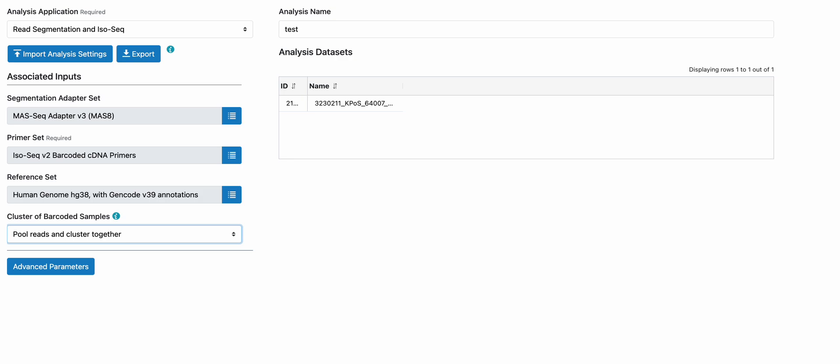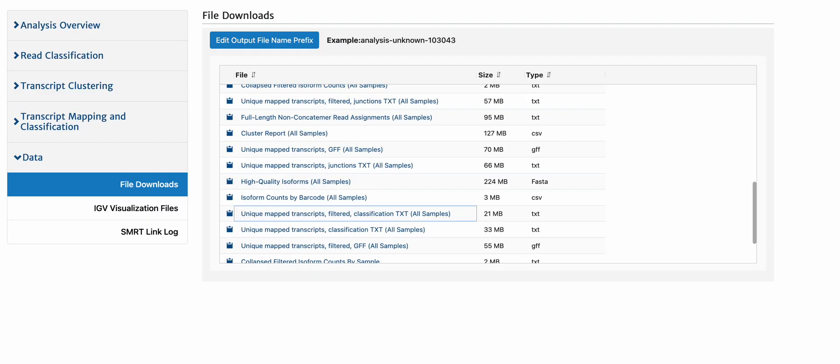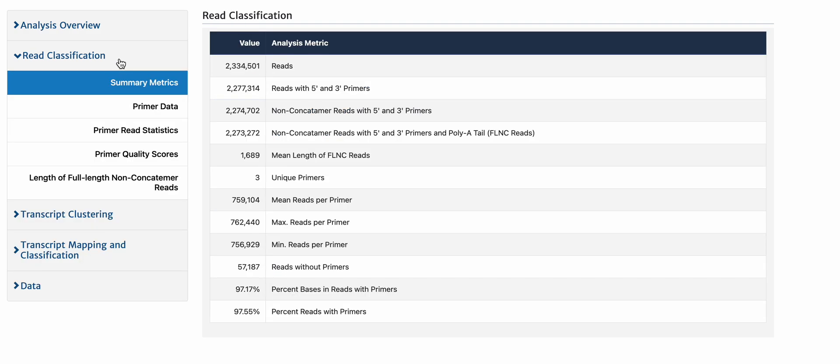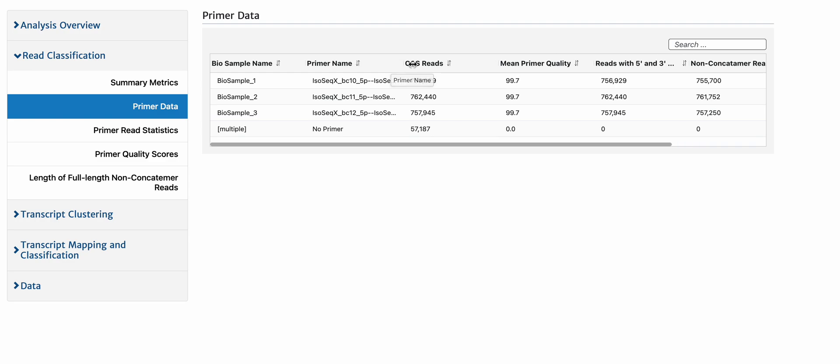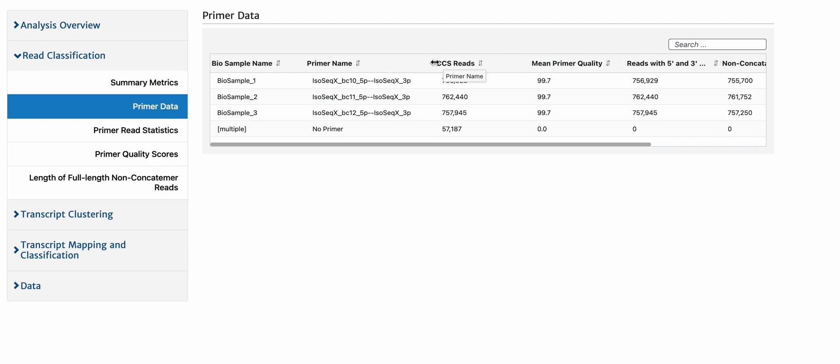Let's take a look. I've chosen two toy examples and I've run them once with pull reads and cluster together and once with separately. This is the pull reads result. You can see that I had subsampled three different barcodes, each of about 700,000 reads each.